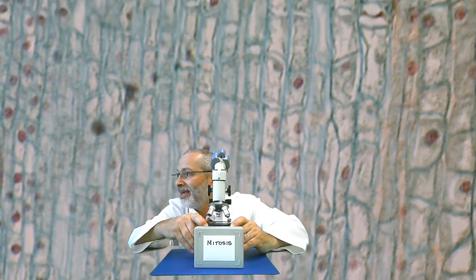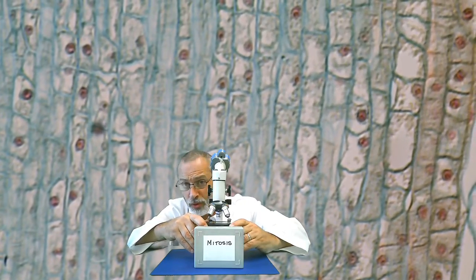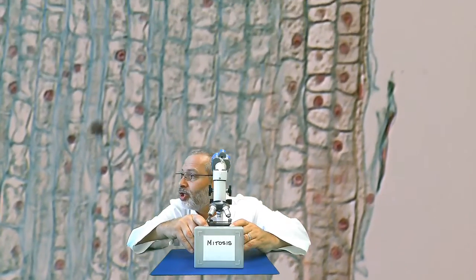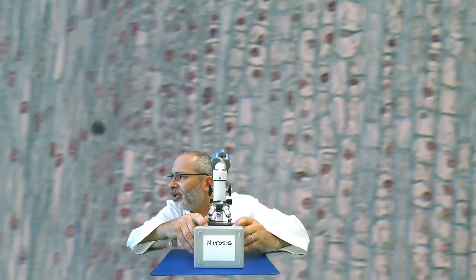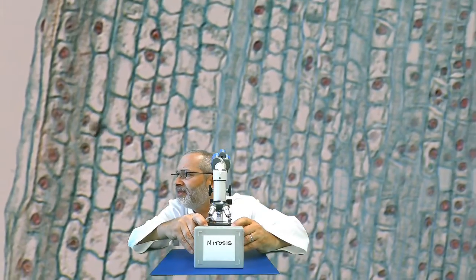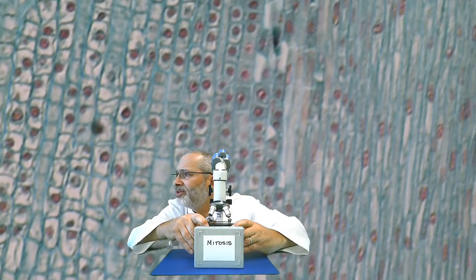Now again, it may be overwhelming to look around, but what you will want to do is moving the stage. You want to hunt around. You want to explore. Once you have it in focus, which I already do, you want to hunt around to a place where you see lots of different cells undergoing cellular division.